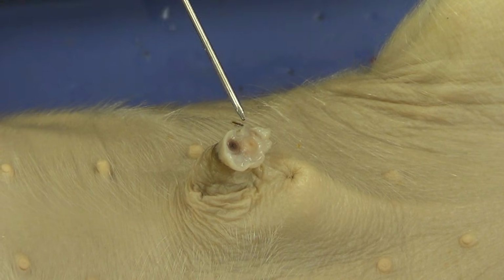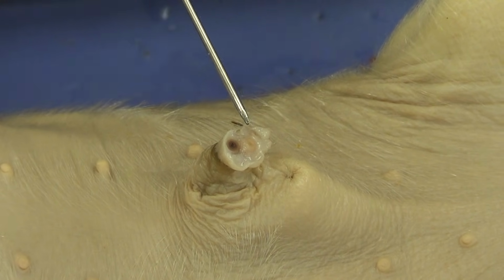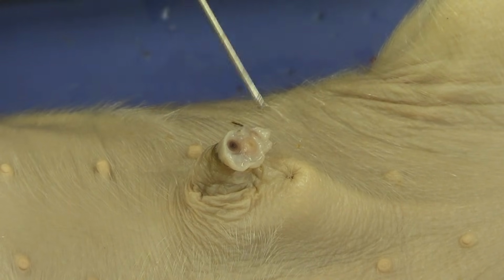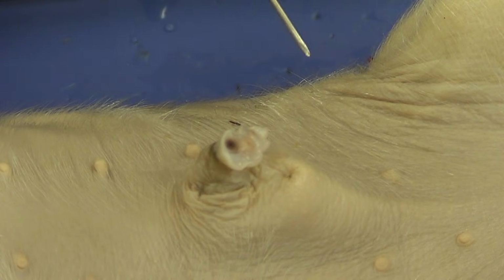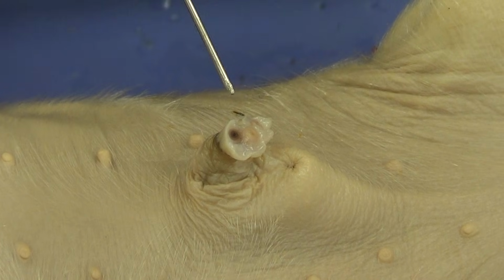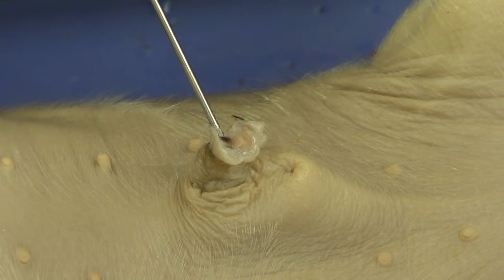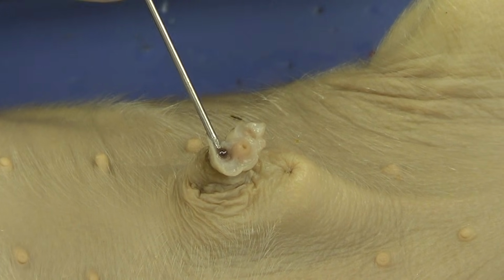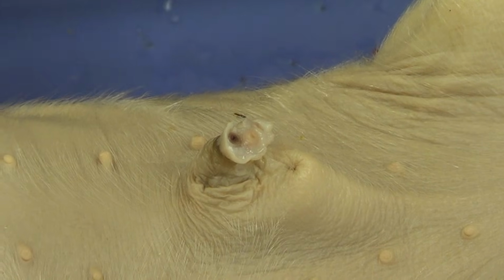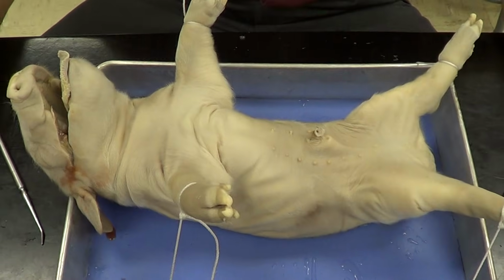Now arteries tend to be a little thicker and they tend to hold their shape, a little bit rounder on average. And that tends to give these guys away as umbilical arteries. Also in the fetal pig, the umbilical vein tends to be a little bit larger. So this one large vein right here, it's also a slightly different color, is going to be the umbilical vein. So identify those structures.